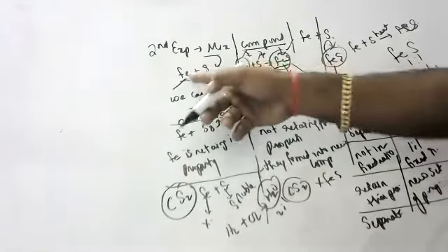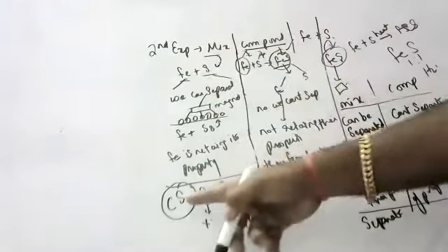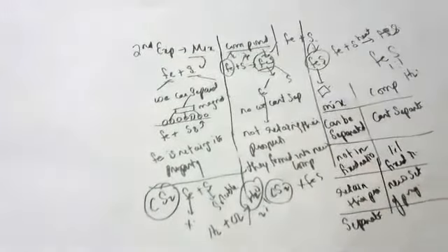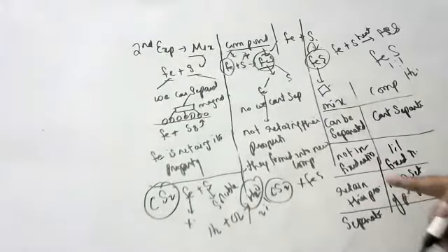Iron has magnetism initially, and sulfur was dissolving in carbon disulfide initially. Yes, they will get new properties. The compound will get new properties, children. And if you want to separate iron and sulfur, you can't separate them physically. You have to go for some chemical process only.